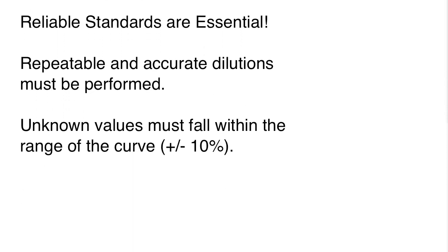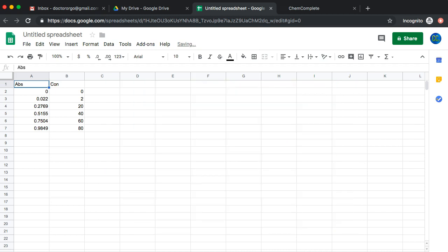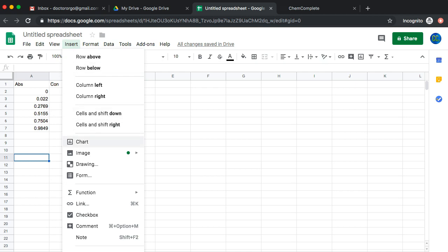Let's go ahead and switch over here, and we are going to take a look at how to actually do this. Here is the spreadsheet. We're doing this in Google Docs, and it would be similar if you're doing it in something like Excel. Let's say this is the data set that you're working with. You have absorbance and concentration. You made your dilutions in the lab, put your samples in a spectrophotometer and got these absorbance readings. You're ready to make your standard curve.